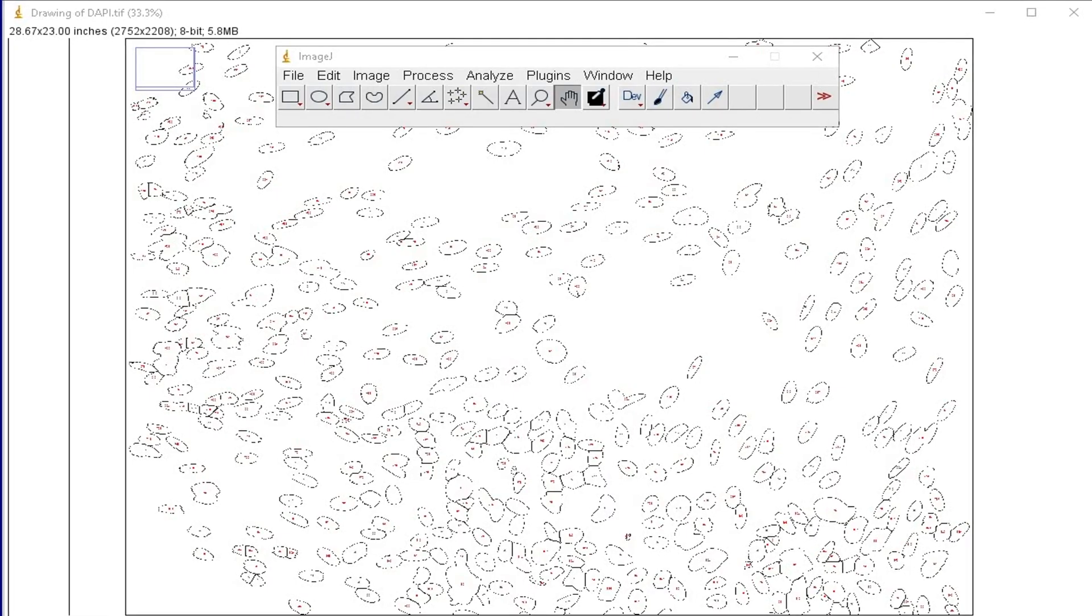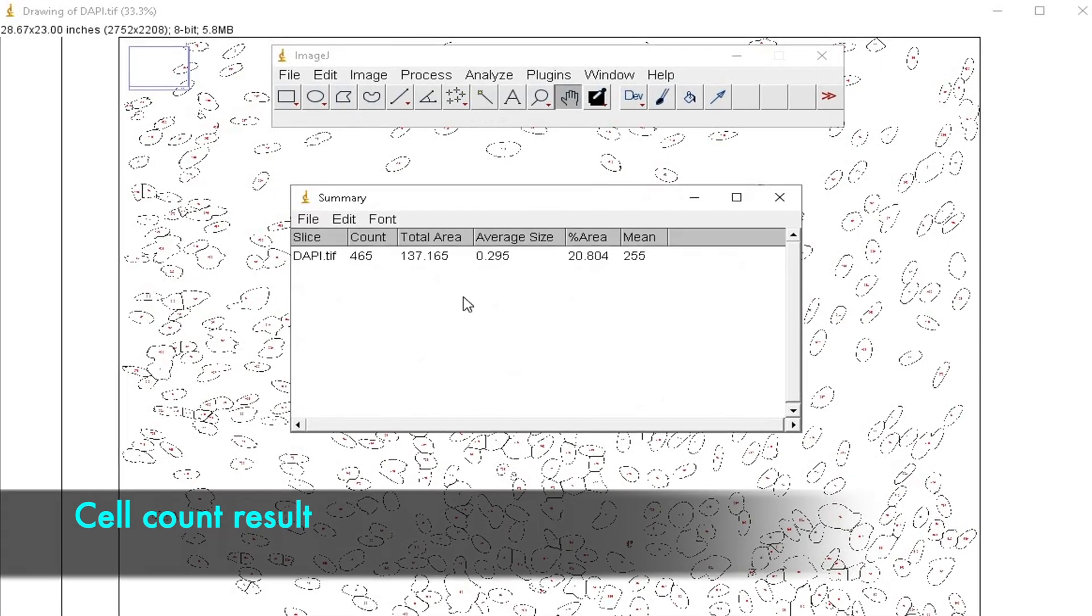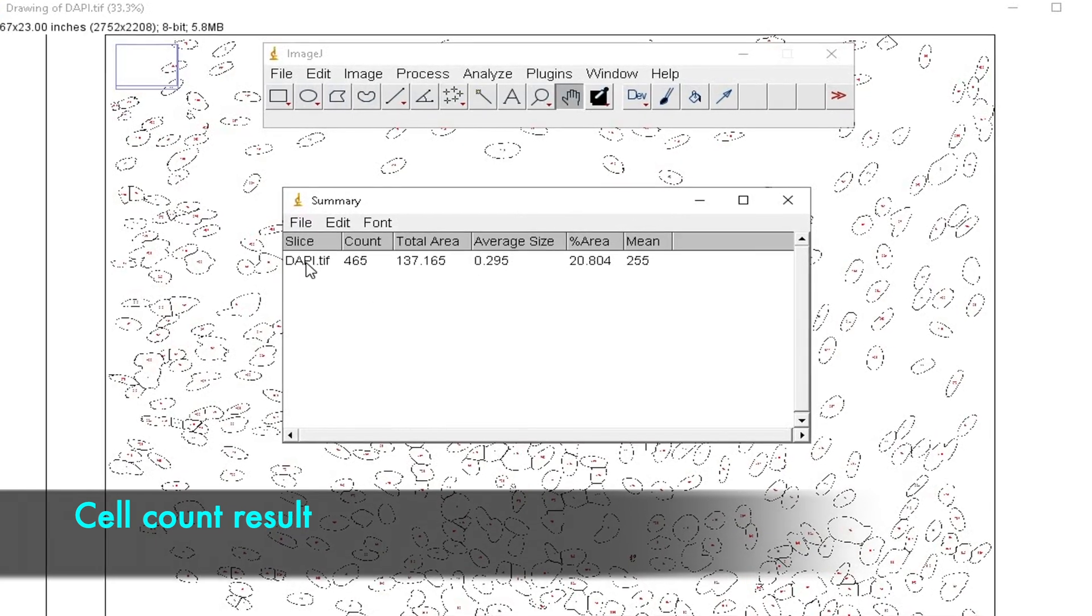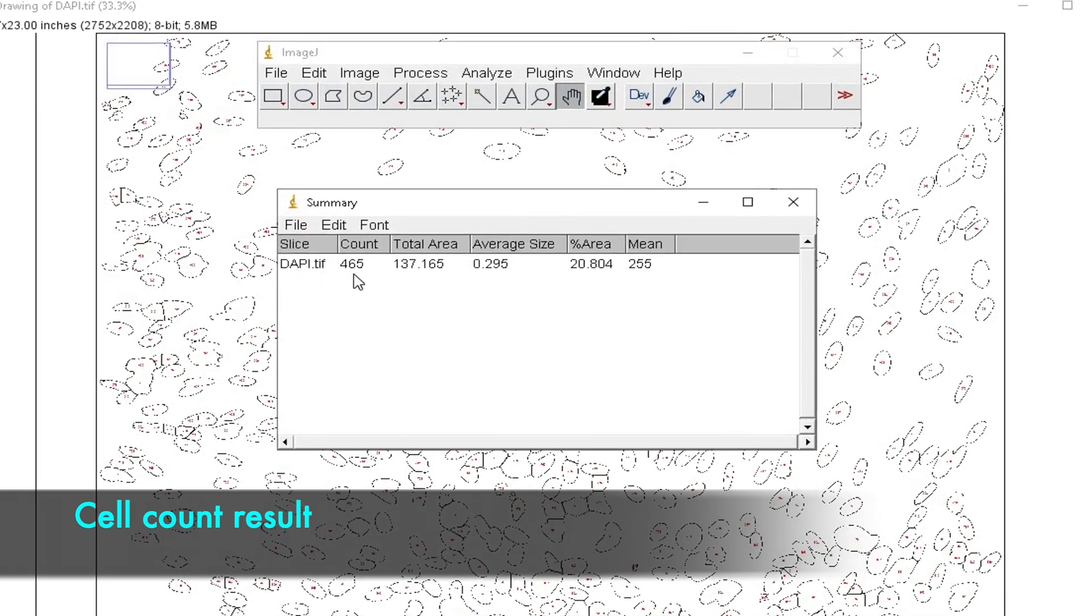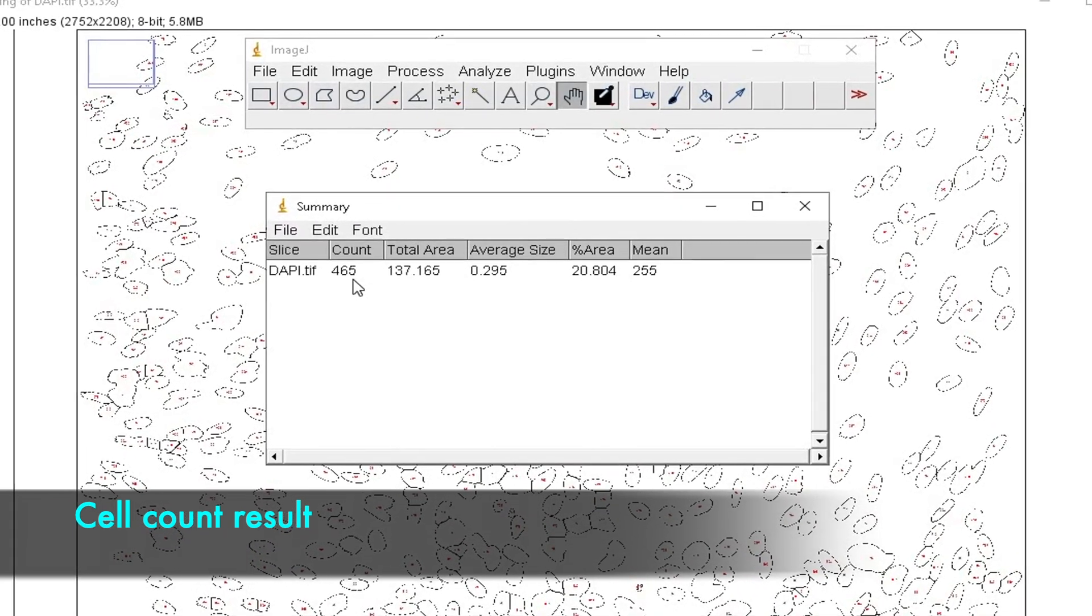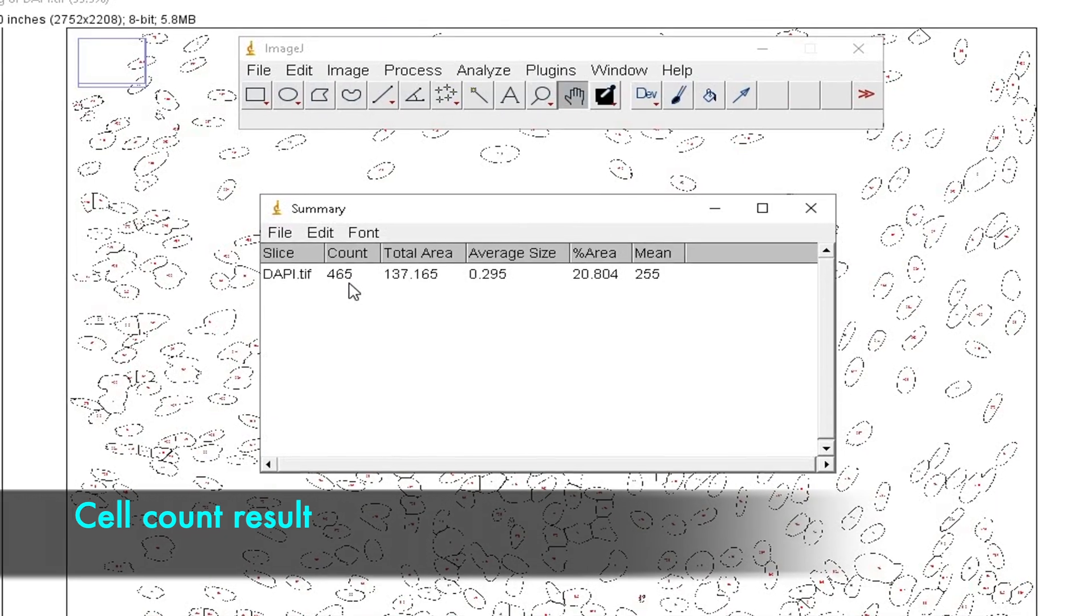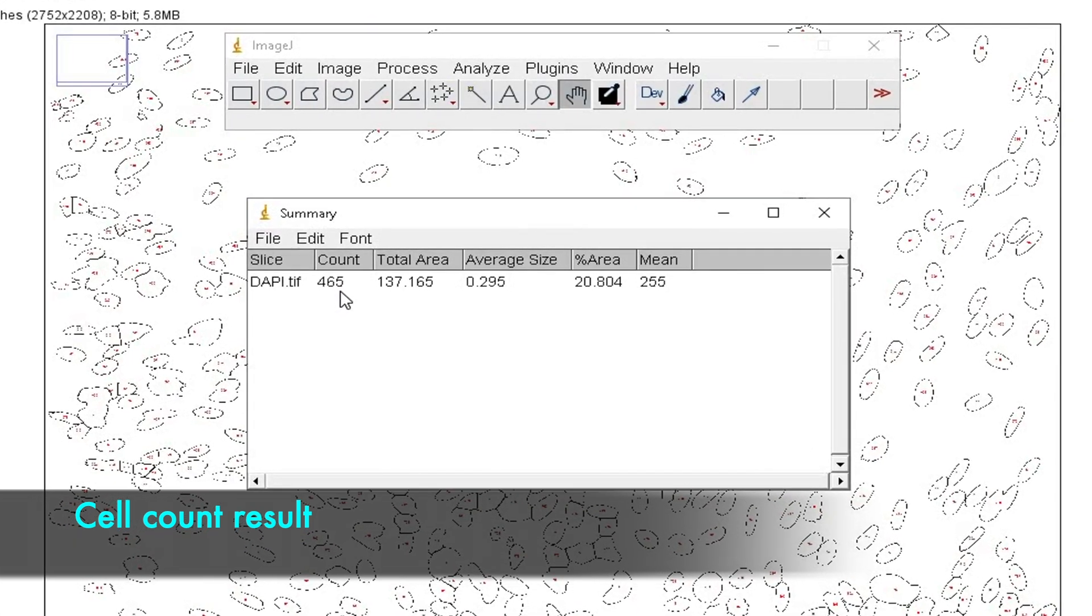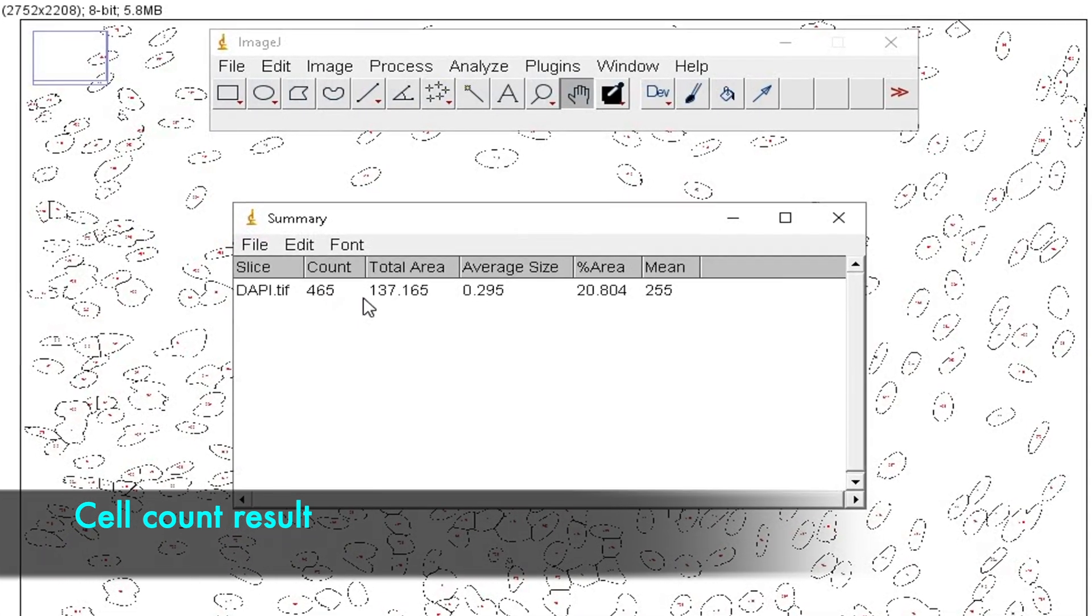The summary window shows the name of the image imported, along with the total number of cell counts. Our analysis shows the cell counts to be 465 in numbers.